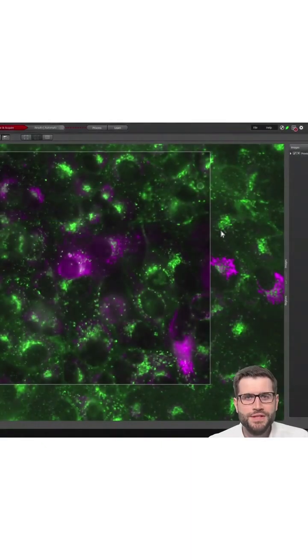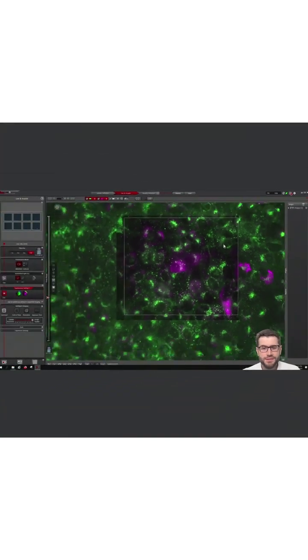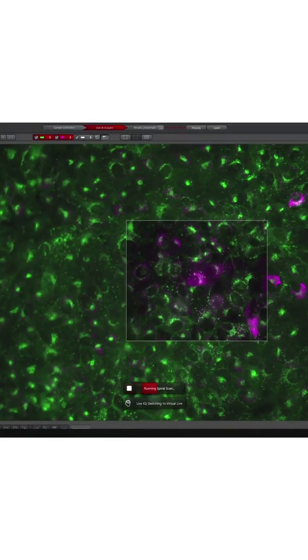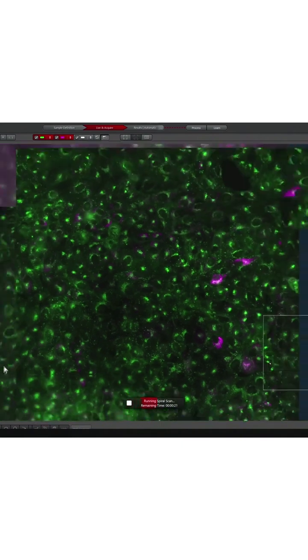Here I am using the 63x water objective with Mika's auto immersion. This means that I can even do a spiral scan without reapplying water manually — it's just done by itself.